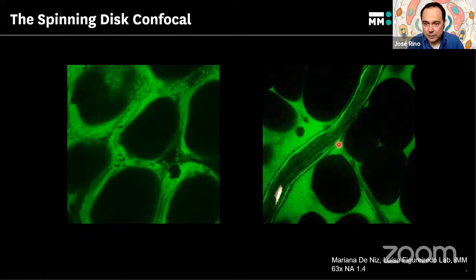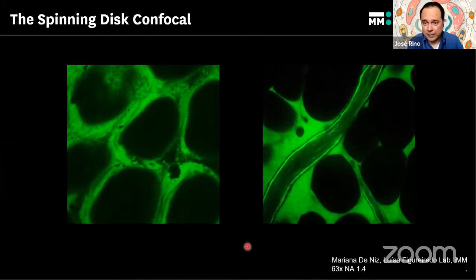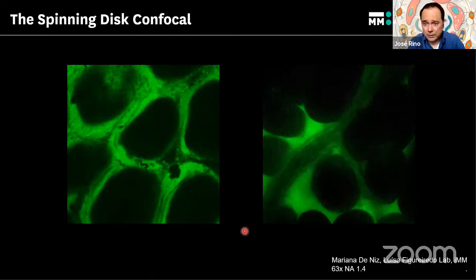This is done looking at the blood vessel there. Look how fast the spinning disk can go. We couldn't do this on the wide field, of course. We wouldn't be able to even image a Trypanosoma without the optical sectioning ability. You'd not be able to even resolve the detail and get the optical sections for this on a point scanning confocal. You could never go this fast, period. So the spinning disk is the ideal system for this.